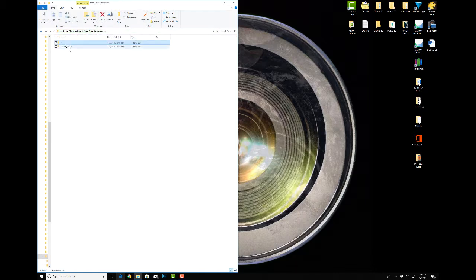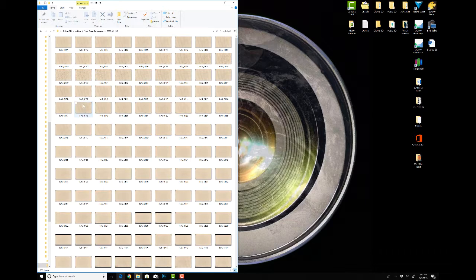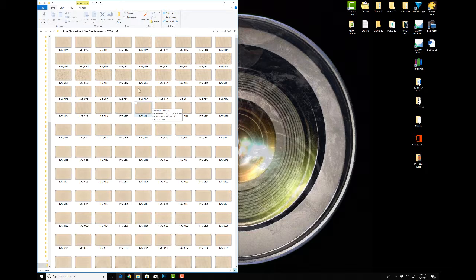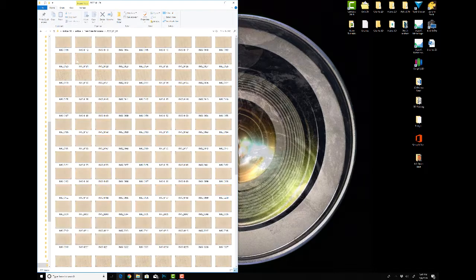Now, like I said, I was going to let it run so that we get a set of 3 total images. But realistically, you're going to let this run through until the entire core sample is finished. It would have been 65, meaning a total folder count of 66. In this case, we're going to go back to the folder where it was storing all of the subsequent images after we took away the first focus set.